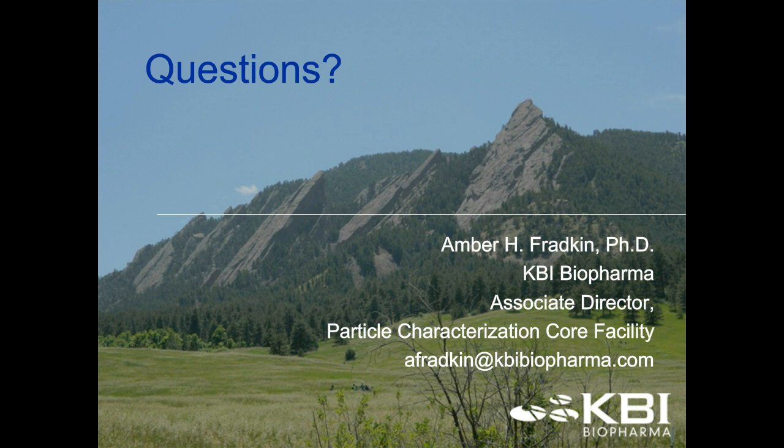I know it's tough because very early on you're quite limited in the amount of material available, but some of these techniques can actually use quite small volumes. For instance, the viscosizer, you can get away with 6 microliters of solution. So as early as possible, it's really important to employ one or more of these techniques to help characterize and build that robust data set to help you assess your product, again, as you hit those later phases.